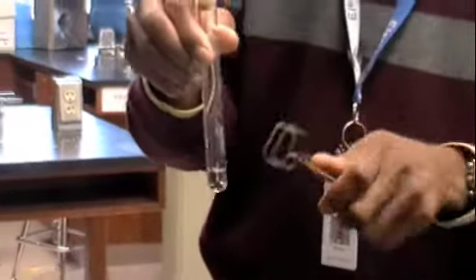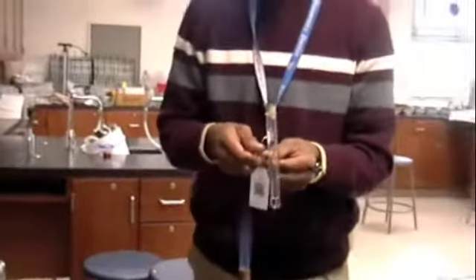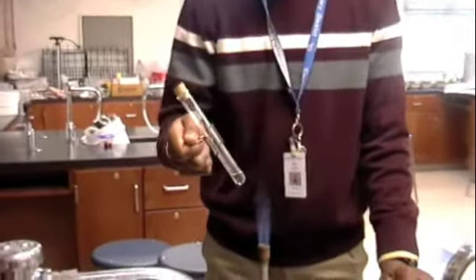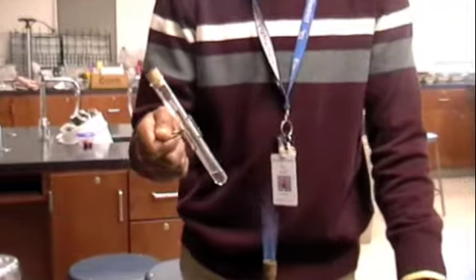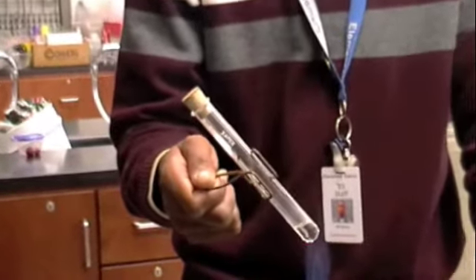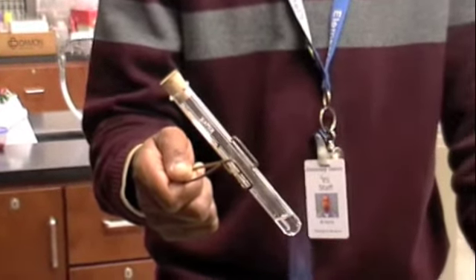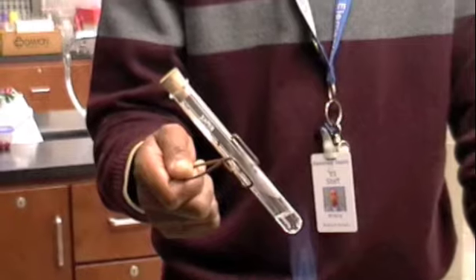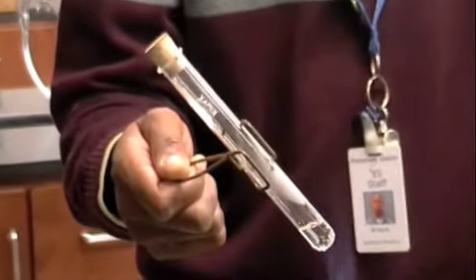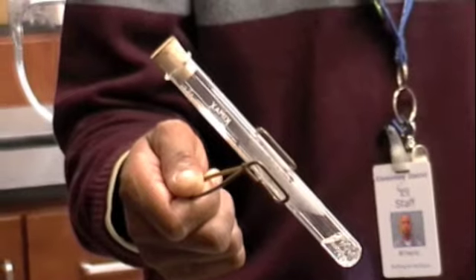I have test tube tongs. I'm going to hold the test tube, the base of the test tube, just over the flame so that the water is heated. Okay, here we go. The water's starting to boil.